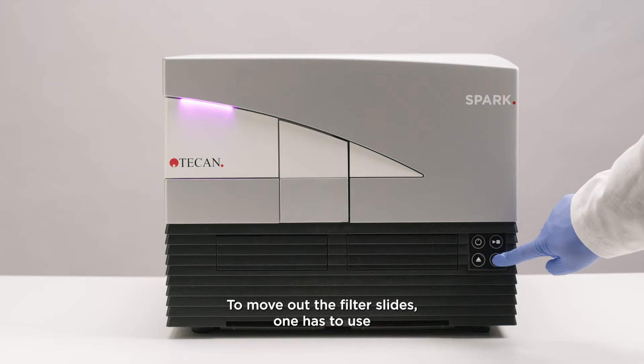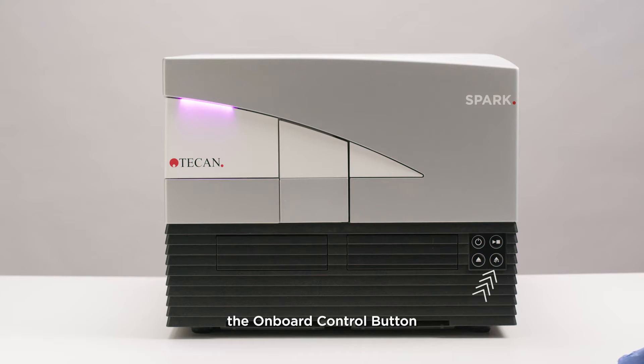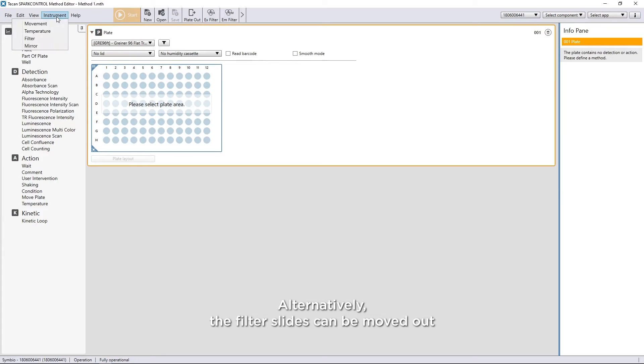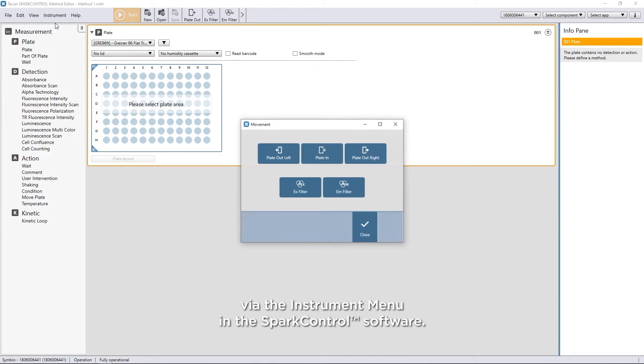To move out the filter slides, one has to use the onboard control button Eject Filters. Alternatively, the filter slides can be moved out via the instrument menu in the SPARK control software.